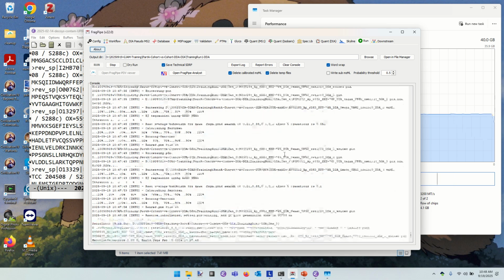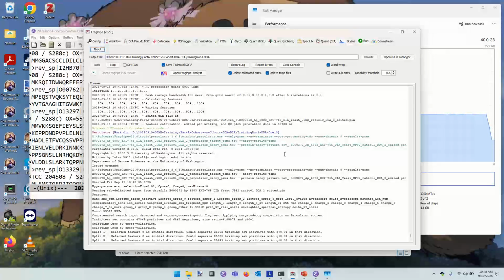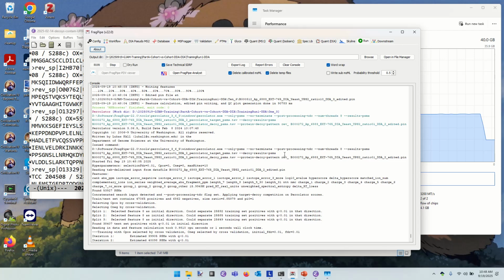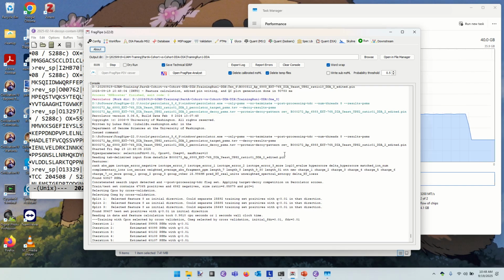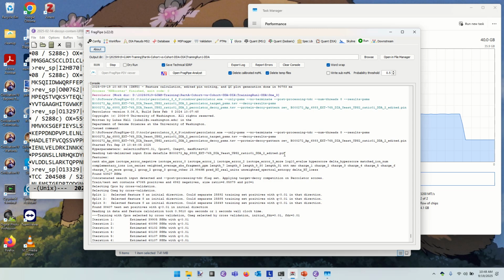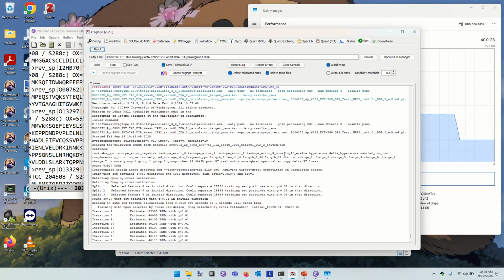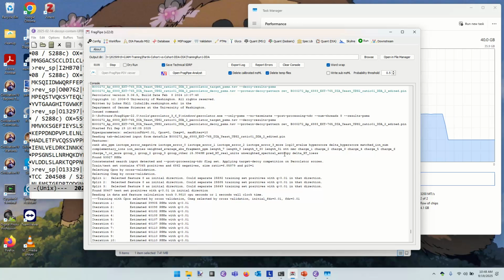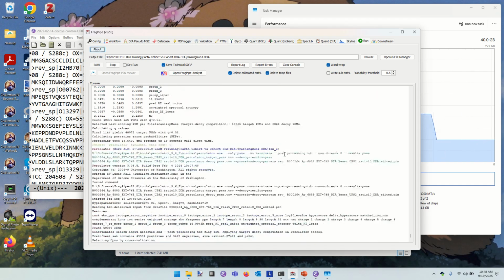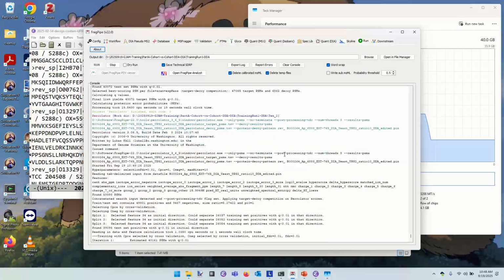It still has to do some mass recalibration to tune it up. But the way that data from the core get quantified is a little unusual, frankly, for DIA experiments, because they rely very heavily on MS1 scans for quantitation rather than making use of chromatograms from fragments. We'll talk about that some more as we get into the later part.